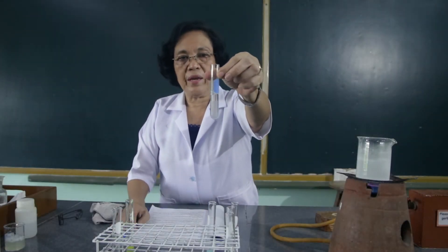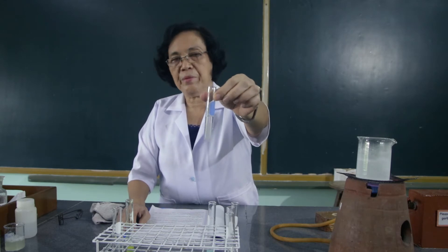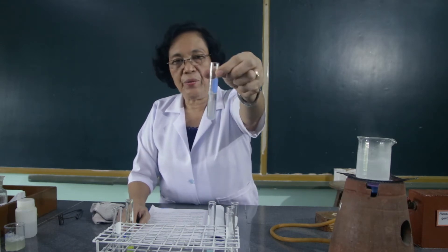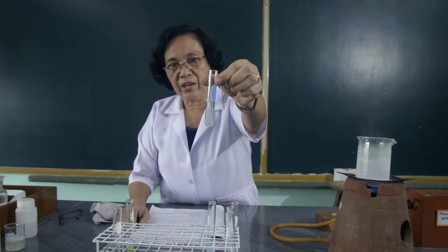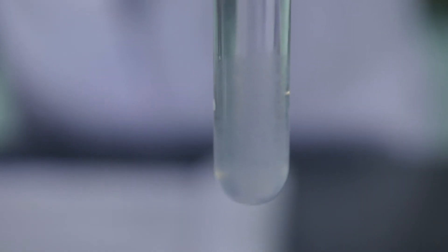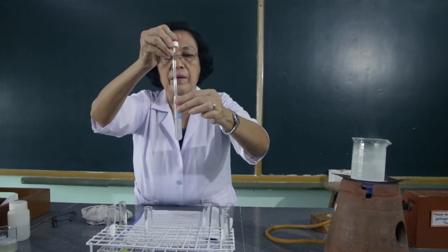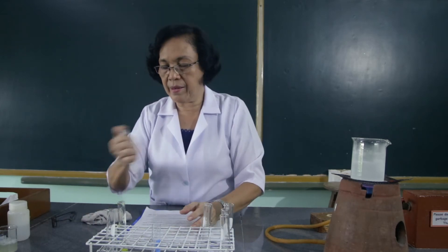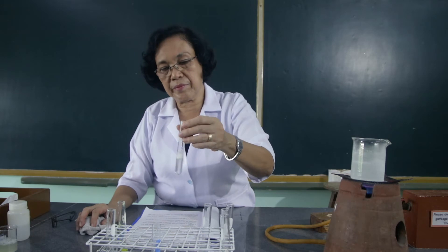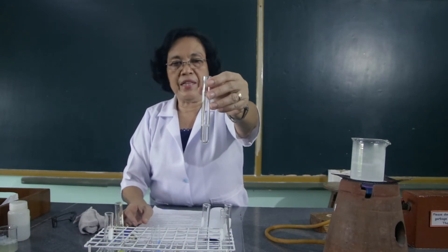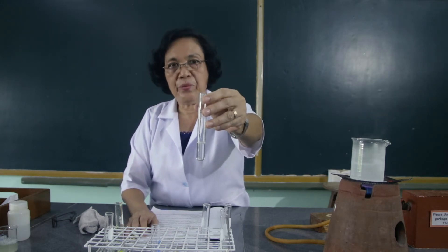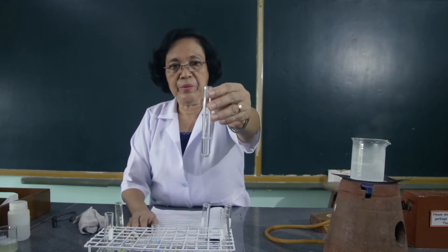This was the precipitate that we formed when the egg albumin was added with the ethyl alcohol and it was set aside for about 30 minutes. With the precipitate that you see at the lower part of the mixture, we are going to dissolve this in water. I want you to observe what happens. This is the precipitate.